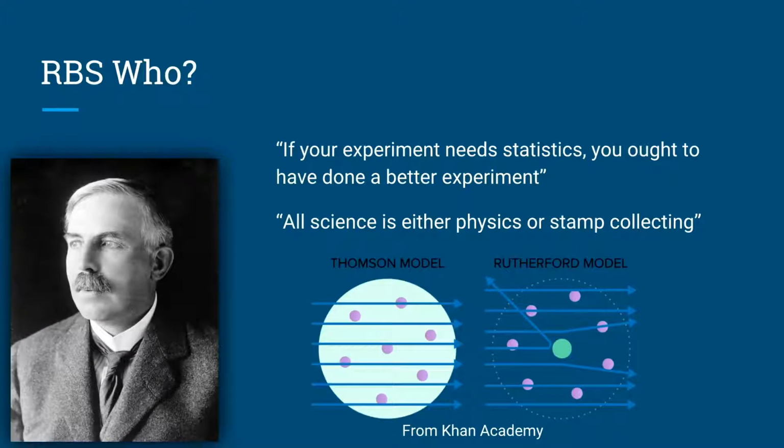While Rutherford's experiment was designed to fire ionized helium particles in air at a gold film, modern RBS systems are substantially more complex.